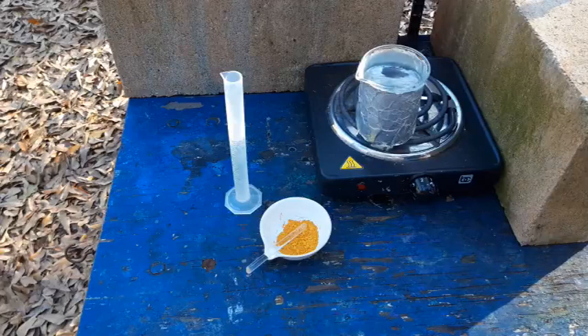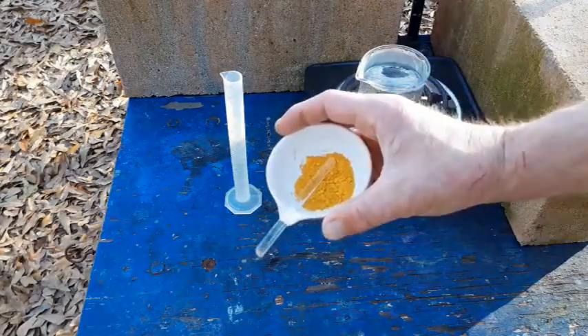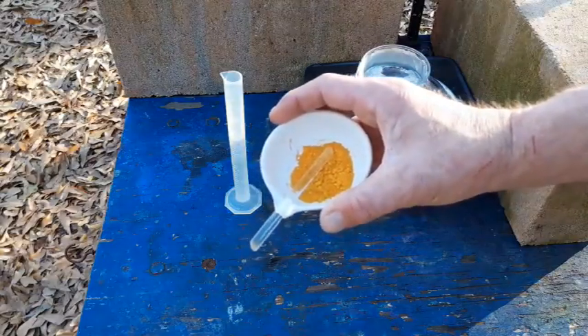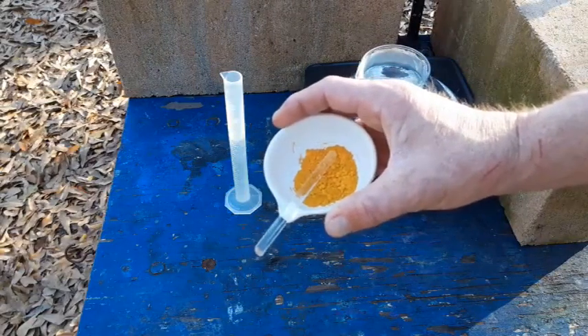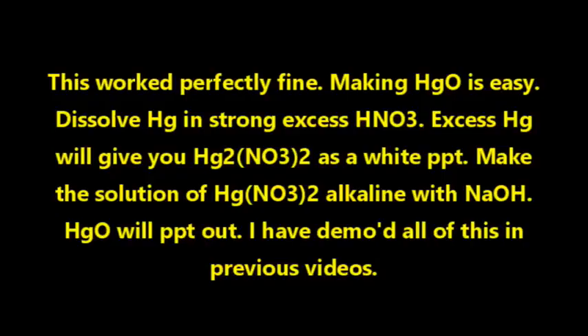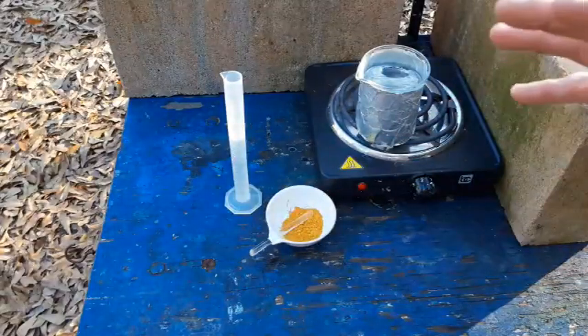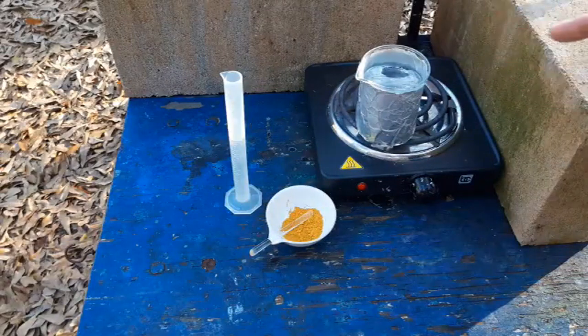The textbook calls for yellow mercuric oxide. Half the time when I make this it turns out yellow and half the time it turns out orange. When I looked up mercuric oxide on Wikipedia it looked exactly like this, so we're going to hope that this works. If anybody knows the difference and why sometimes it's yellow and why sometimes it's orange, I would greatly appreciate it.